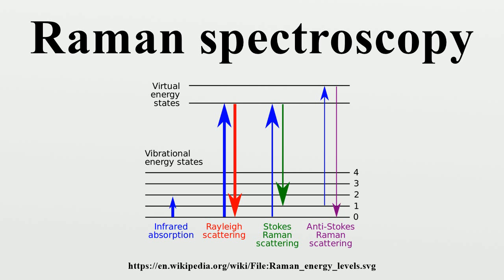Originally, heroic measures were required to obtain Raman spectra due to the low sensitivity of the technique. Typically, the sample was held in a long tube and illuminated along its length with a beam of filtered monochromatic light generated by a gas discharge lamp. The photons that were scattered by this sample were collected through an optical flat at the end of the tube. To maximize the sensitivity, the sample was highly concentrated and relatively large volumes were used.